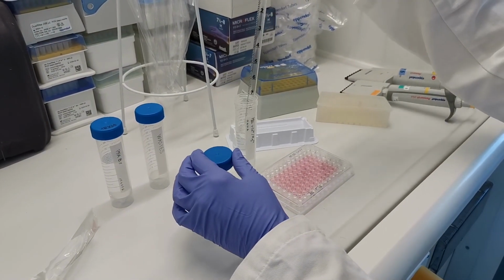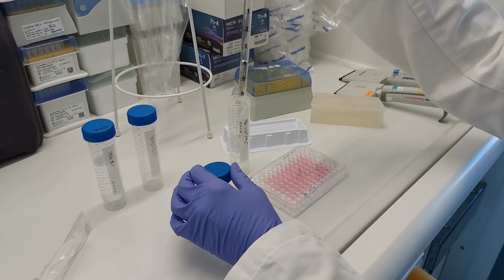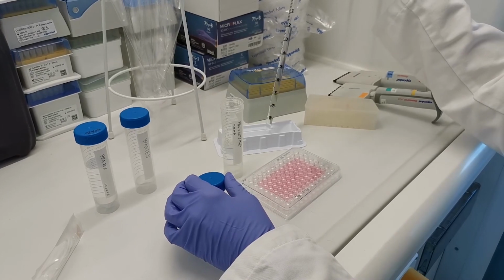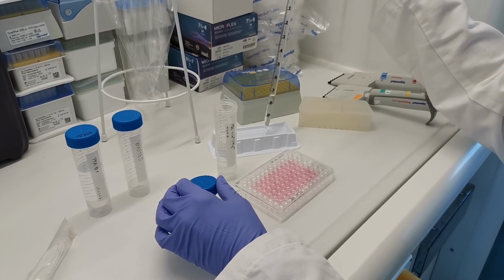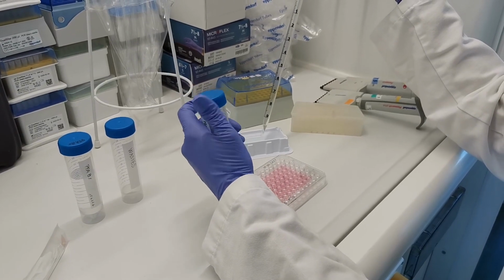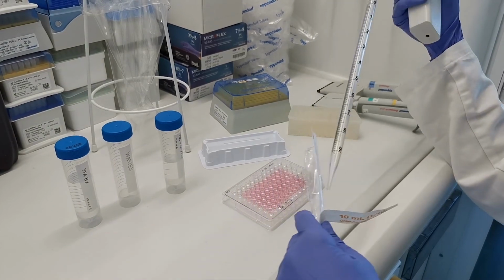150 microliters of PBS supplemented with calcium and magnesium are added to the wells, and this is repeated once, and they are then incubated in this PBS for 10 minutes. This step, using calcium and magnesium, avoids disassembly of the microtissues, as it ensures cell adherence.